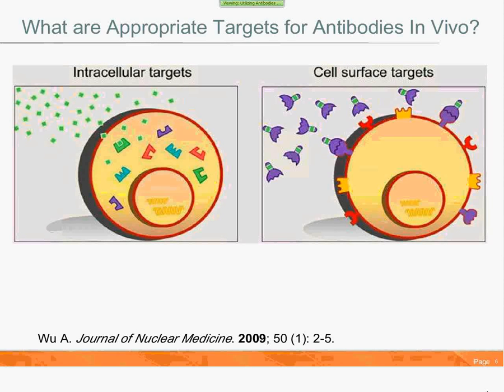When you look at radiotracers, some common labels are I-125, which is somewhat appropriate for westerns and a little bit for in vivo, as long as you're working with small animals like mice and you have a very good radiosynthesis lab so you don't have significant free iodine running around. Indium-111 is very common, and also if you're looking at MRI, magnetic nanocrystals.